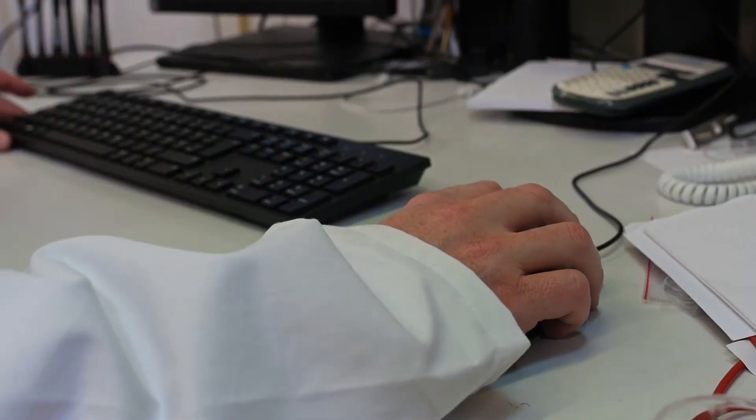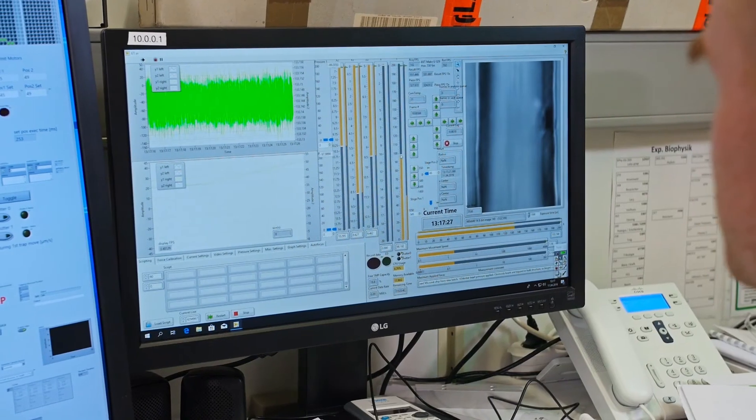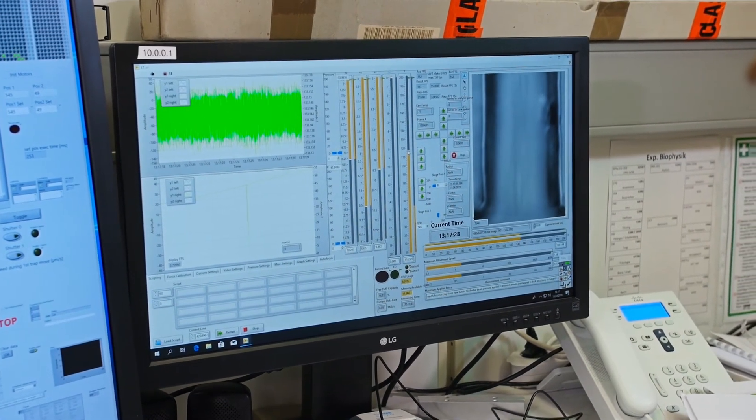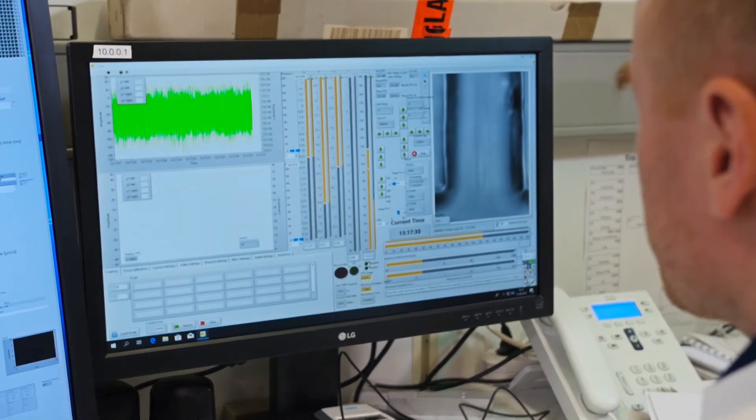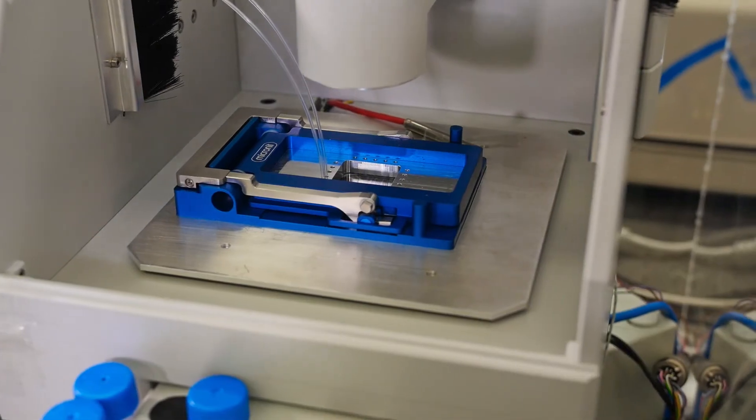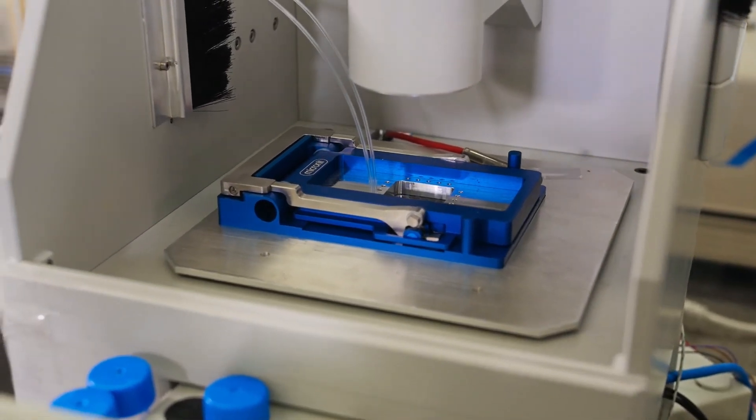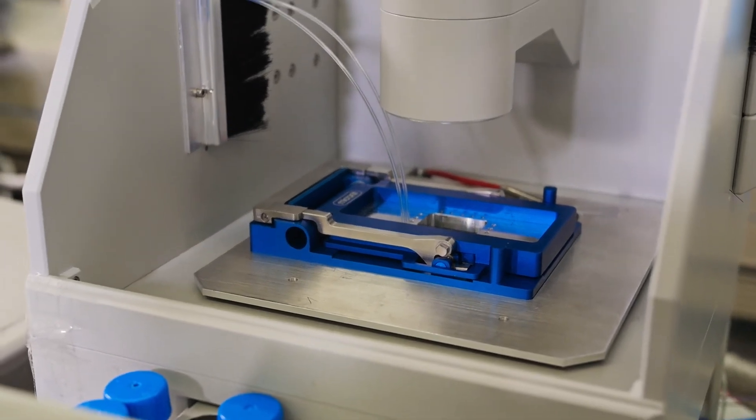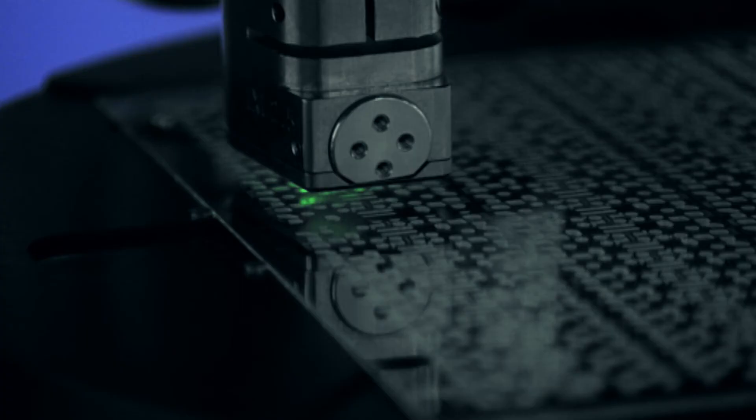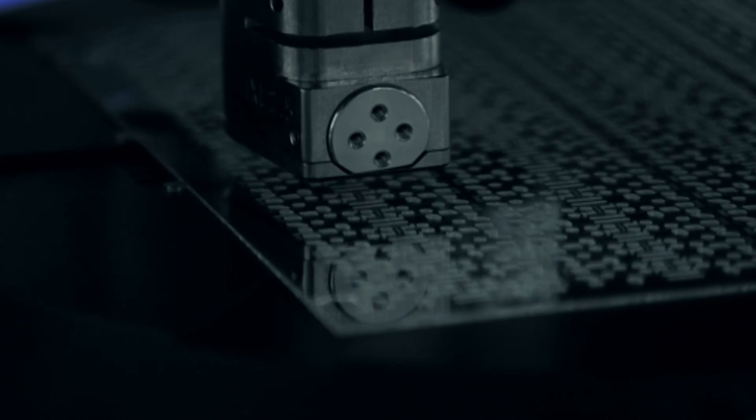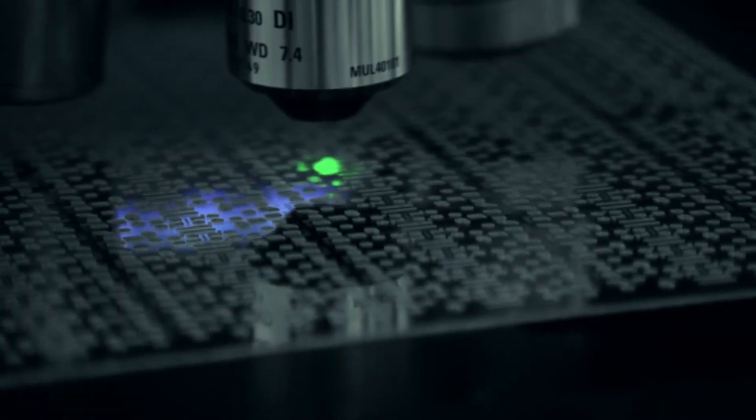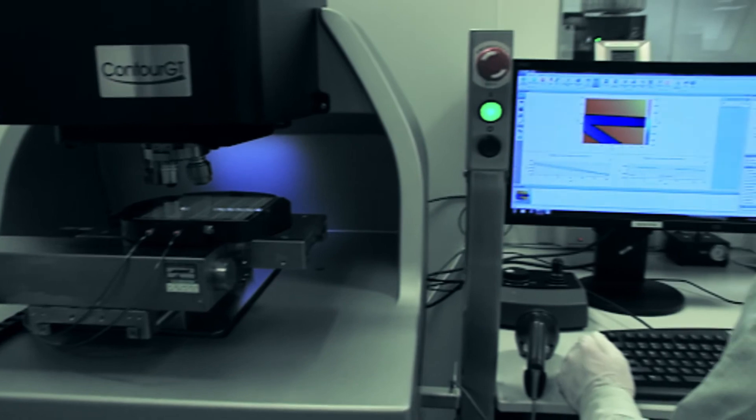The elasto-tweezers instrument also includes advanced software developed by Bielefeld University for high resolution and high content measurements. Finally, a key element towards increasing throughput is to automate the measurements. To that end, a unique dedicated microfluidic cartridge has been realized by the University of Twente and Micronit Micro Technologies to parallelize and automate the bead-cell-bead complex formation, which is the limiting step in the overall measurement scheme.